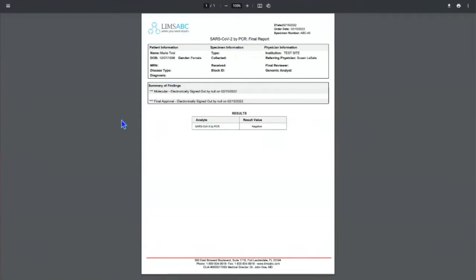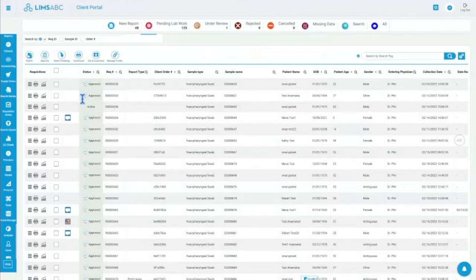The template here is very basic, and part of our implementation, part of the cost that is included with the cost of the system, is to build the report as you need, to make sure your clients get the value, and you provide your value added to your clients through the report. So I'm not going to focus too much on how this report looks, because most of the clients have their own reports they've seen. But it's easy to get to it. You come here, you click.